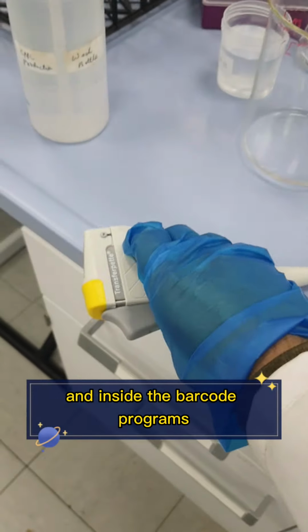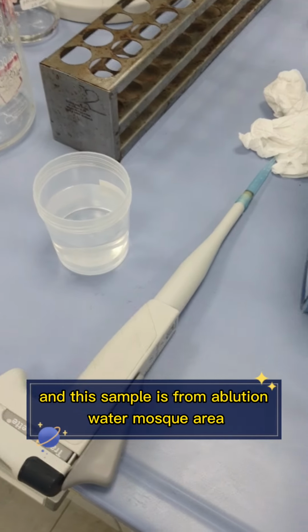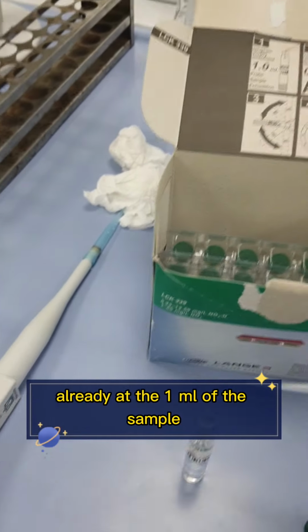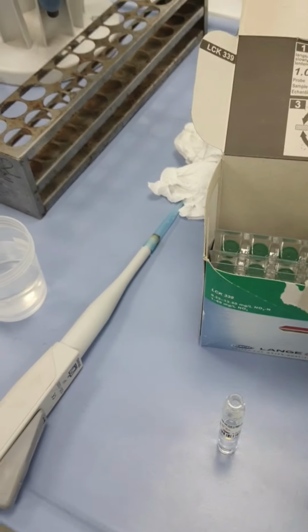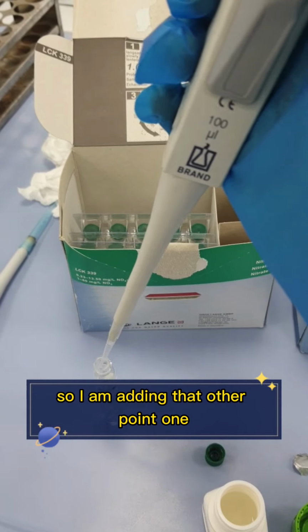So after adding the required amount of 1 ml of the sample, and this sample is from ablution water, mosque area, now I will add 0.2 ml of the reagent. Already added 1 ml of the sample, so now I am adding 0.2. This 0.1 is done, so I'm adding that other 0.1.